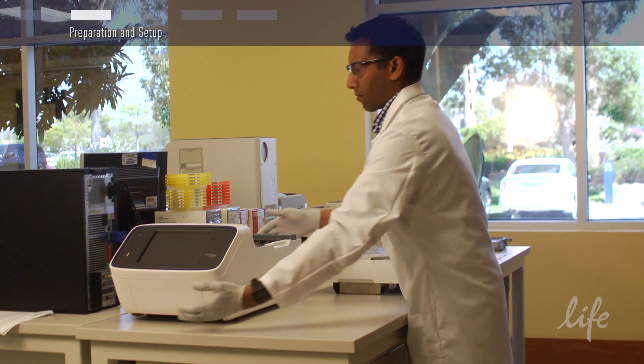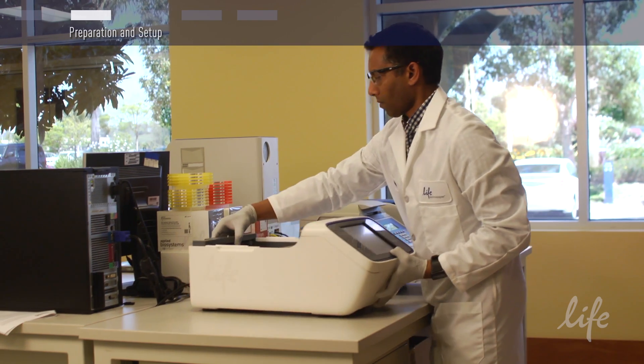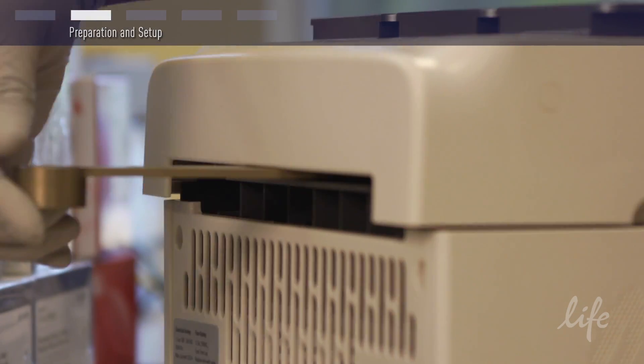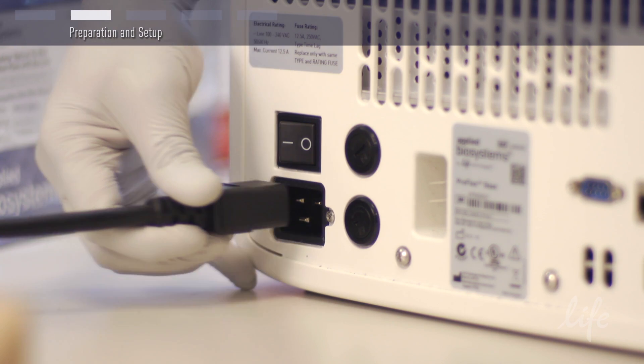Once you have removed the system from its packaging, place the base on your bench, attach your block with the lid levers towards you, and attach the power cord.